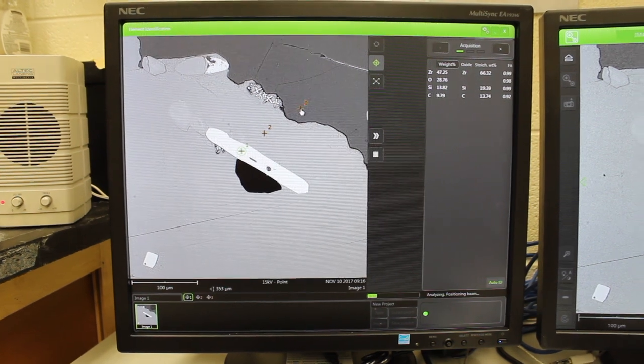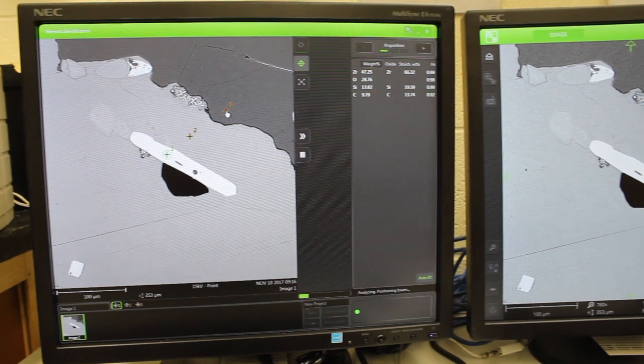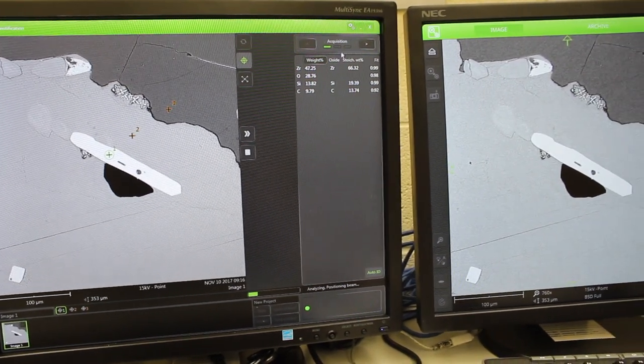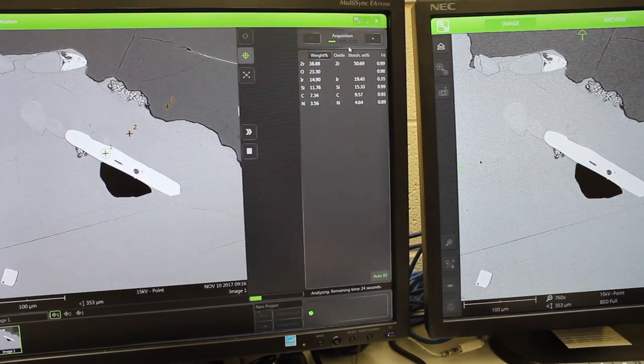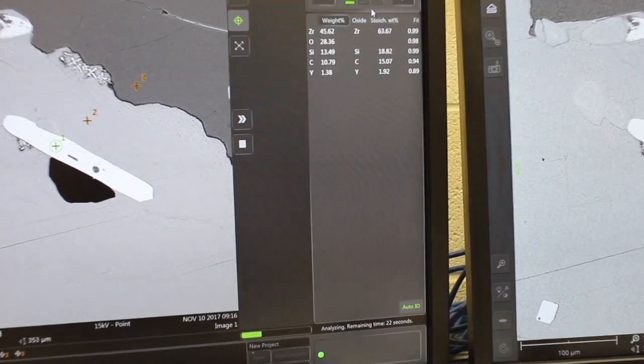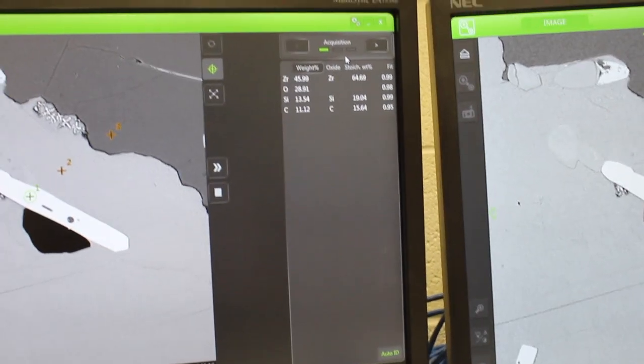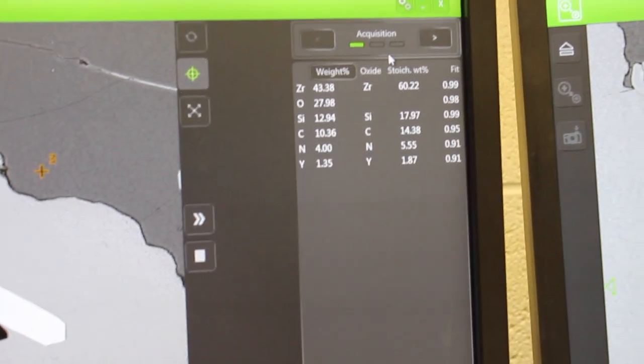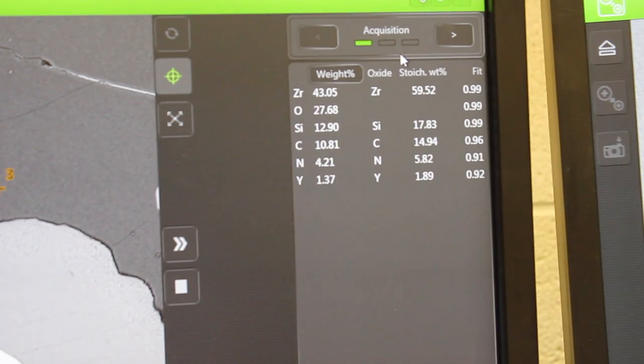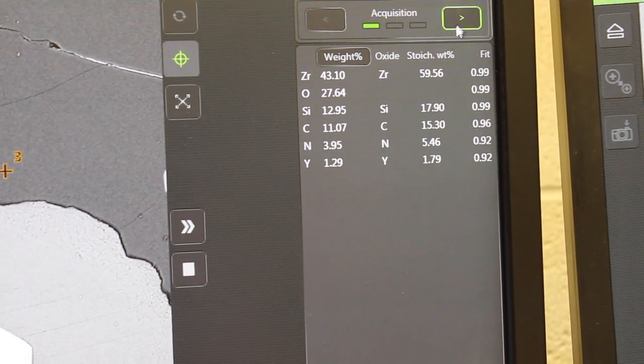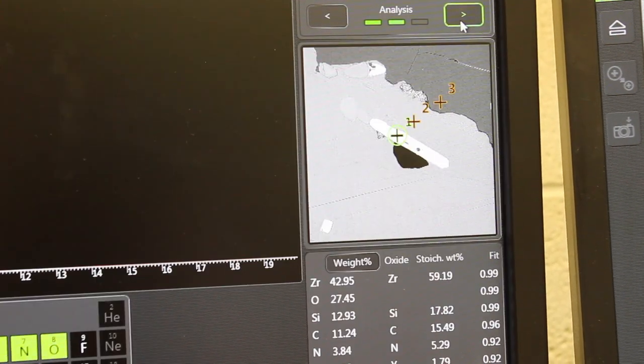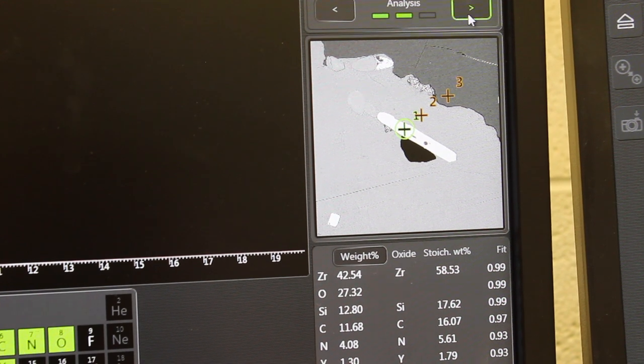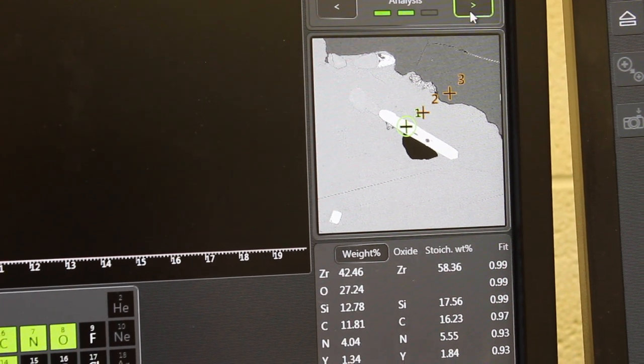You can look at what you're analyzing by going over here to this window on the right-hand side and toggling from acquisition to analysis.